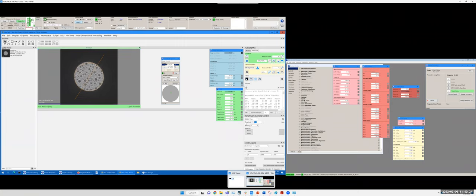So run the camera time, maybe 100. If you increase the exposure time of the CCD camera, you make this image sharper so the measurements are more accurate. But you can see we used 50 before, and it is still converging. So it's not that a low exposure time won't work or anything like that. It's just affecting it a little bit. And you can see we are already done. So all 100%, showing good stuff.